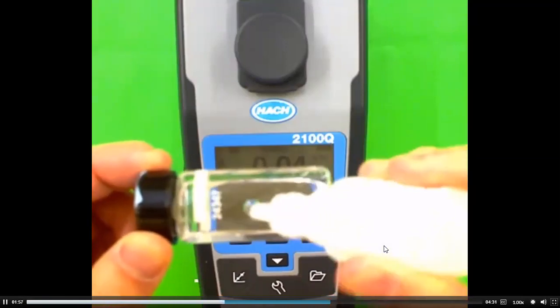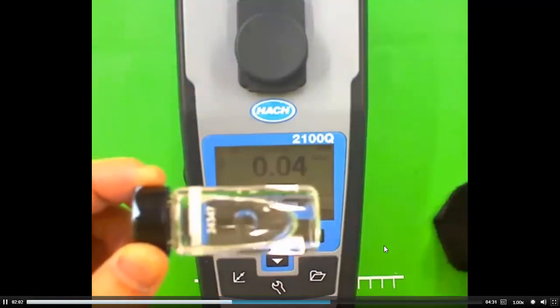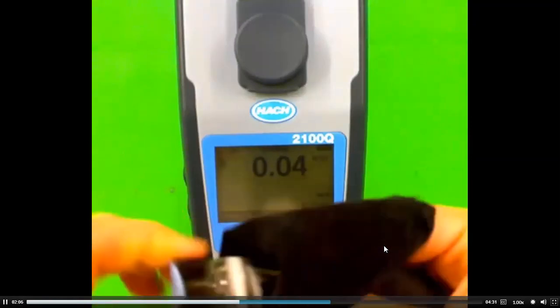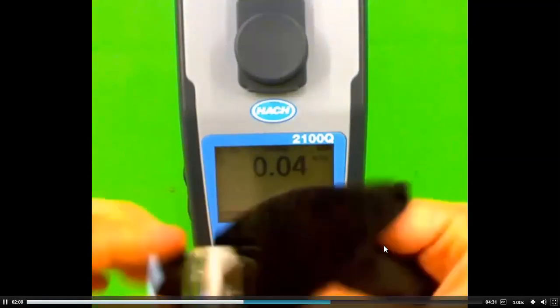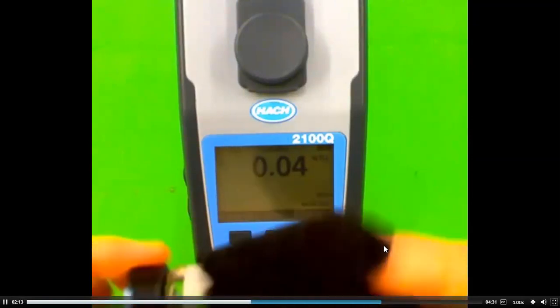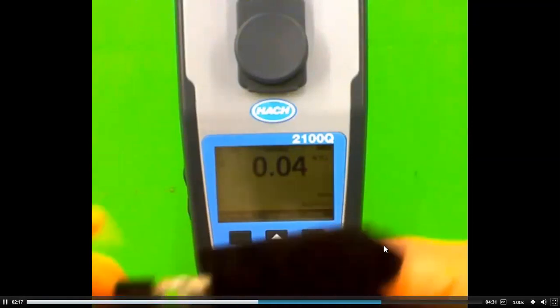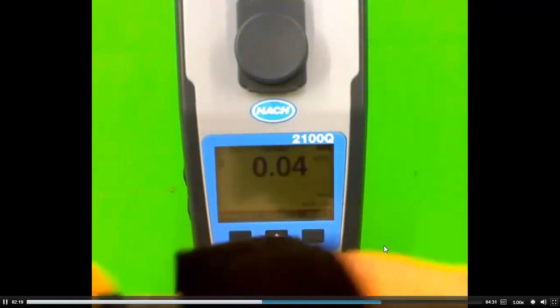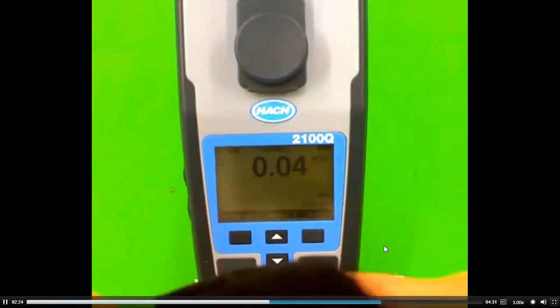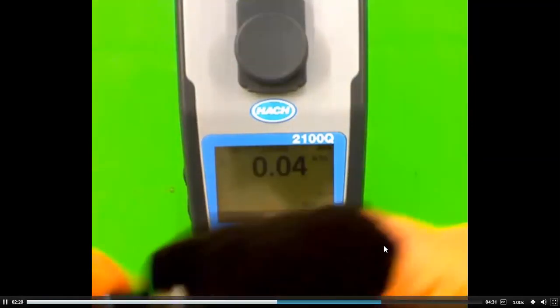We then take a dry microfiber cloth and rub the silicon oil into the surface of our sample vial. The silicon oil has the same optical properties as the glass that this vial is made out of. That allows it to fill in any scratches or marks and wipe off anything like fingerprints that may be previously existing on the surface of this vial.